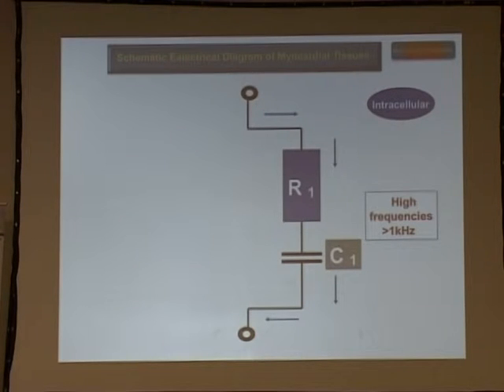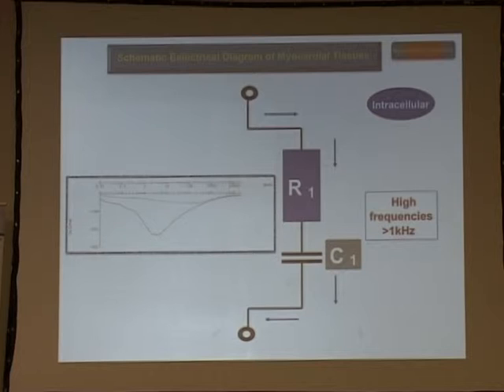And again, how to prove? Very easily. Again the same time schedule, 25 minutes and 200 minutes, and you see at higher frequencies the change of resistance is obvious.